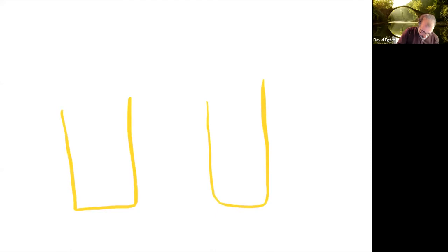So you use a thing called a hydrometer. Let's say this is sugary, let's say this is grape juice. And this is after the yeast has worked. Now this is wine.